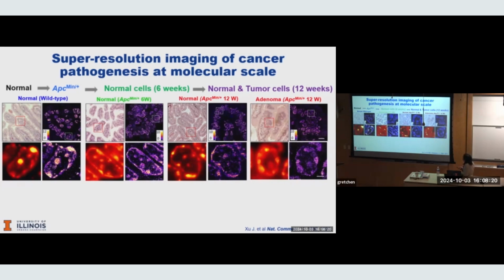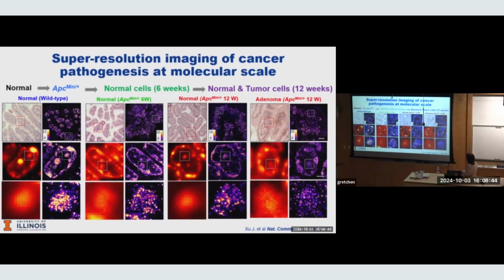So this red color here, this is the microscopic wide field, diffraction limited. This is a super resolution. You see this individual one is a single nucleus, and the dense packed regions are those condensed forms of chromatin. So to answer the question, what is the size of the nucleosome? We really have to zoom in to that specific region. So you see those microscopic foci, now you see those individual clusters, and that's basically a group of nucleosomes. And I will tell you the exact size in the next slide.